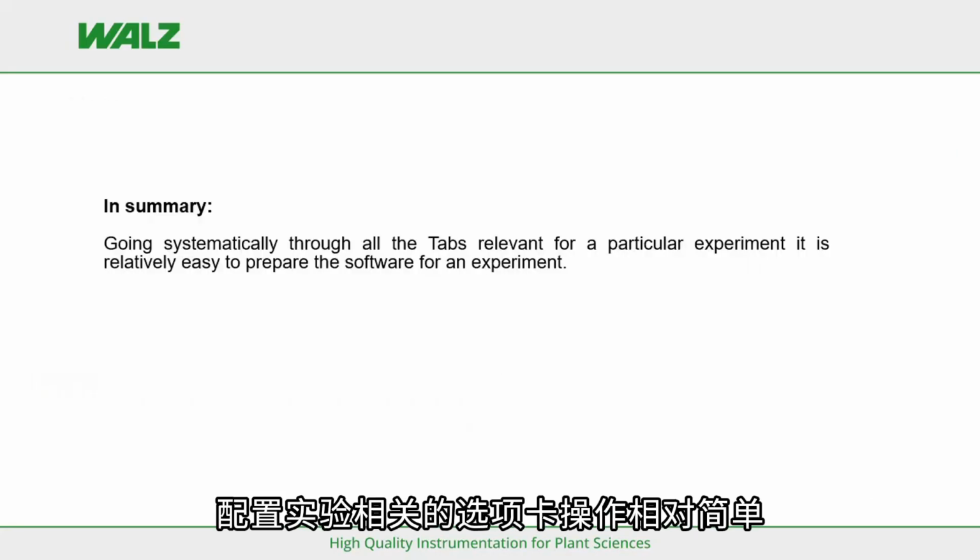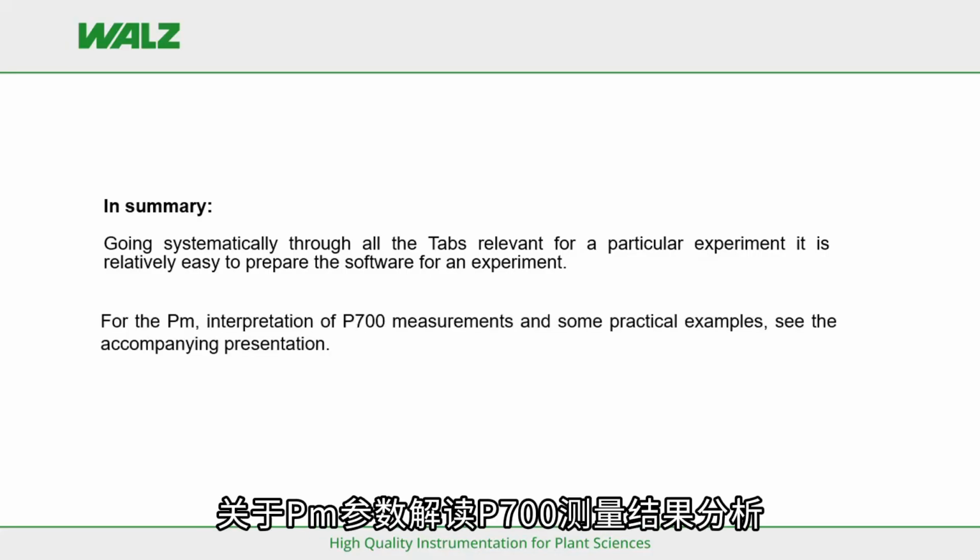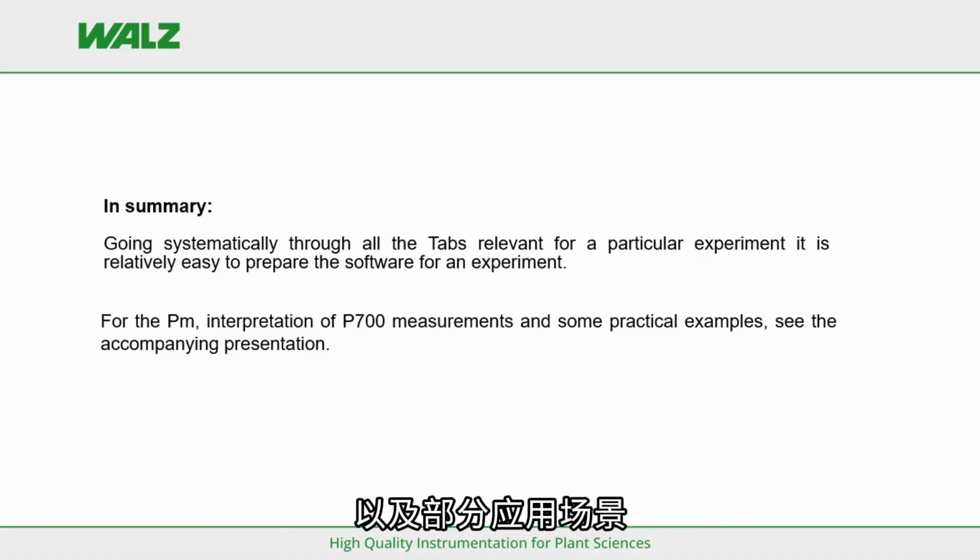In summary, going through the tabs relevant for an experiment, it is relatively easy to prepare the software. For topics like PM, interpretation of P700 measurements, and some applications, see the accompanying presentation.